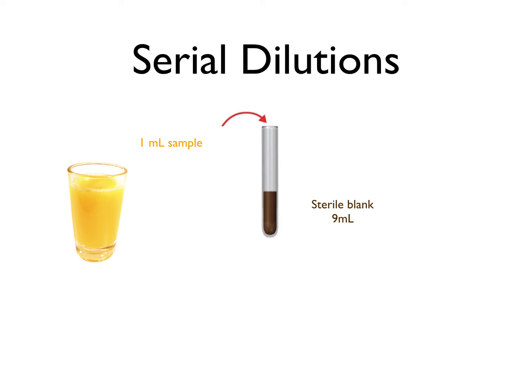The total dilution is written mathematically in exponential form. In this case, the total dilution is 10 to the negative 1 power. When 1 milliliter of the diluted sample is plated on tryptic soy agar and incubated, an overgrowth of bacteria results. Therefore, it's necessary to once again dilute the sample, just like we did when diluting the food coloring in the earlier example.